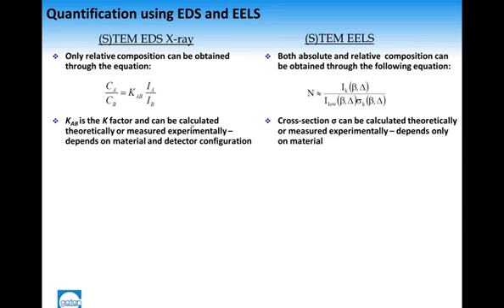And this K factor can be calculated theoretically or measured experimentally. And this again depends on the material and detector configuration.